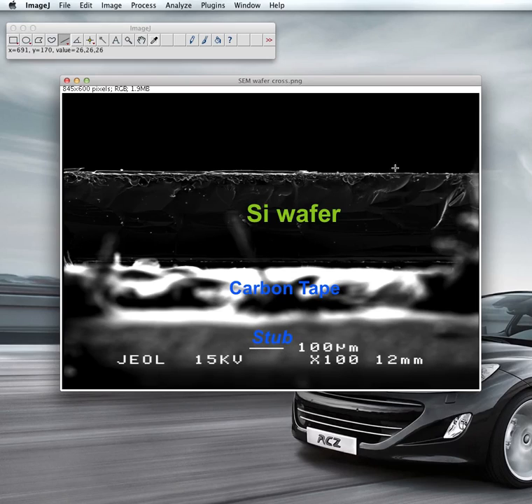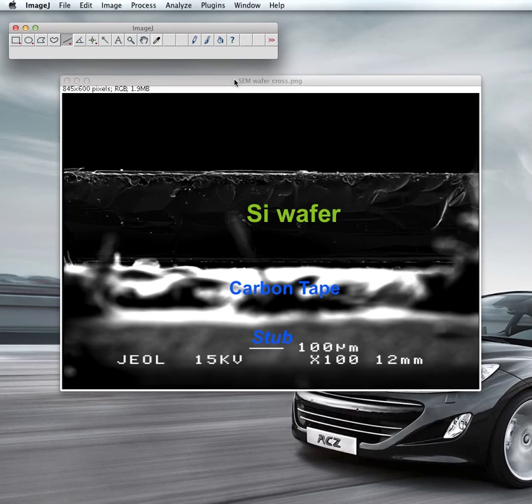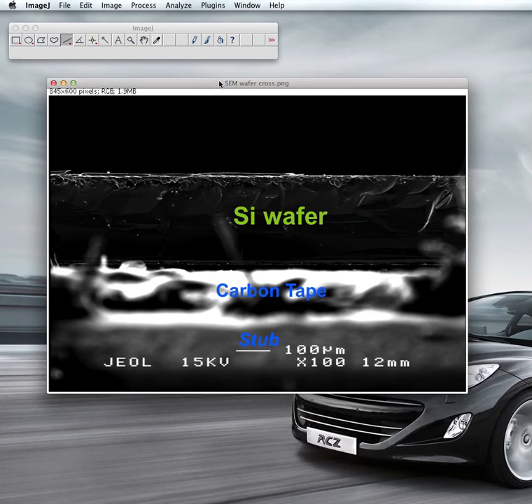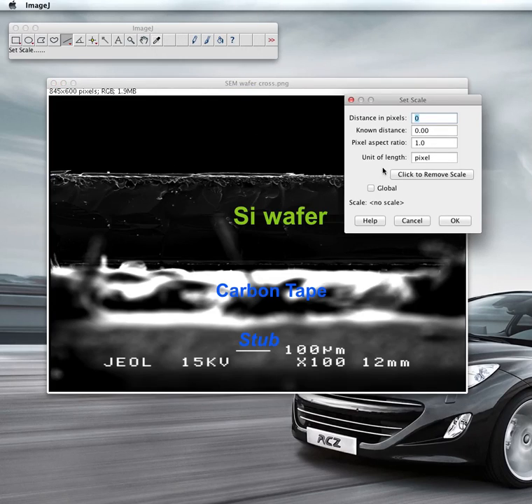This software is capable of translating pixels into centimeters or any length or dimension. To do that, you need to go to Analyze, then Set Scale. You'll see a 'Distance in Pixels' field — but first you need to draw a line.